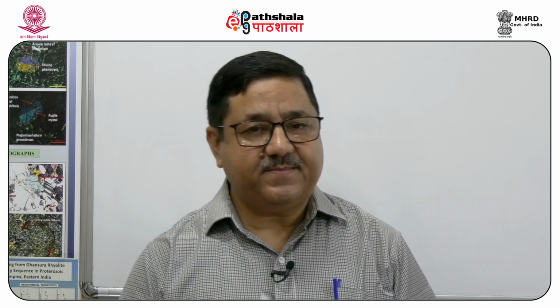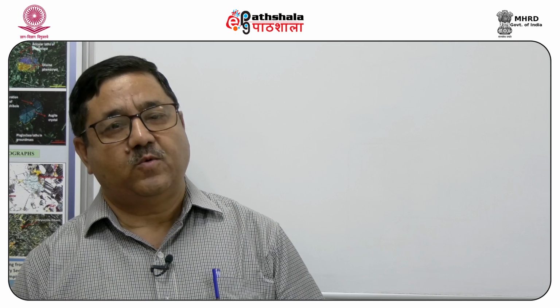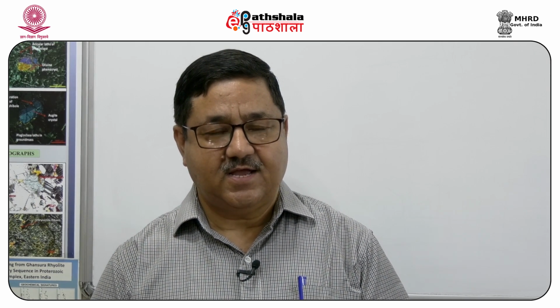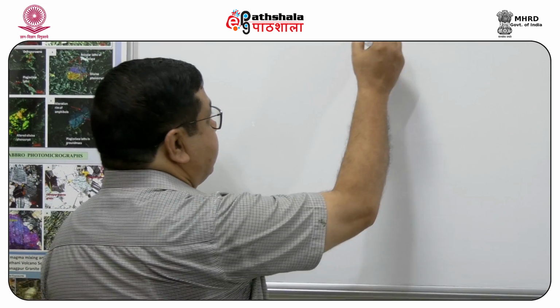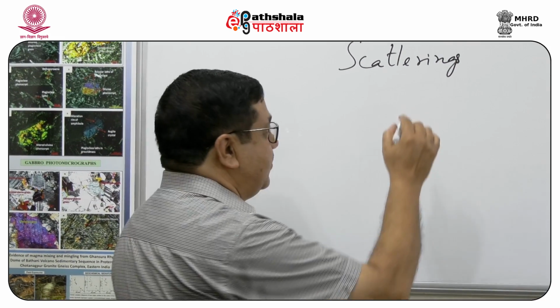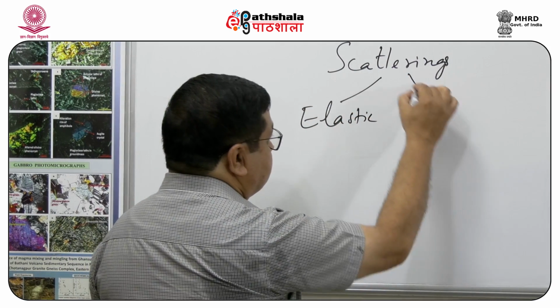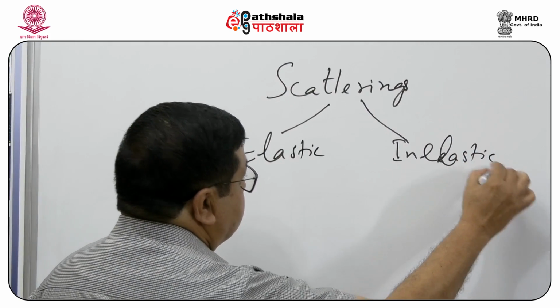As far as the SEM is concerned, two major kinds of things happen when an electron beam interacts with matter, and these things can be classified in two ways. That is, we can call them scatterings of the incident particles, which can be either elastic or inelastic.